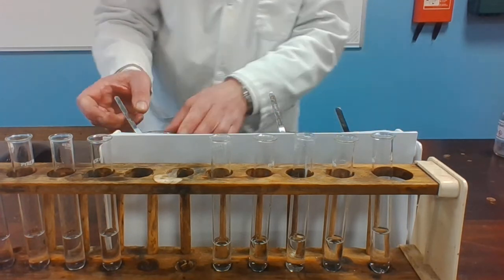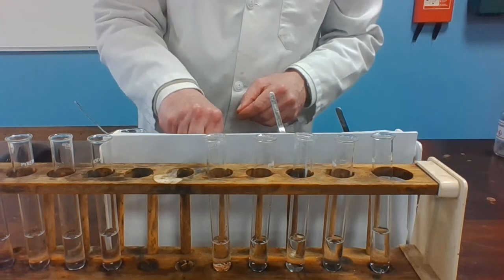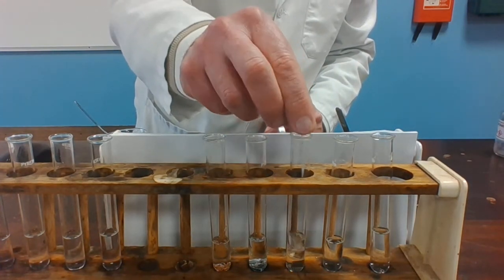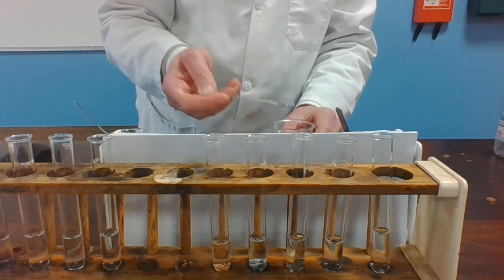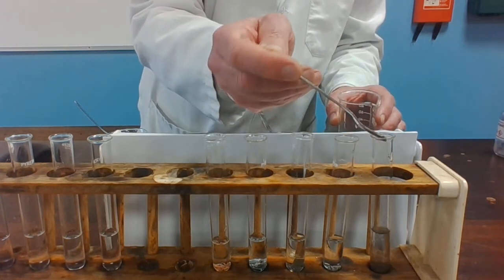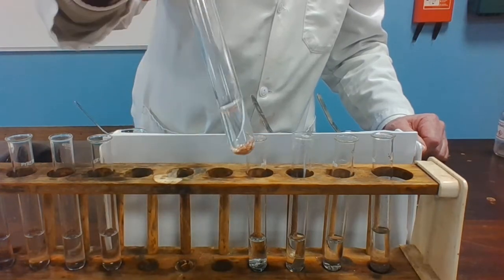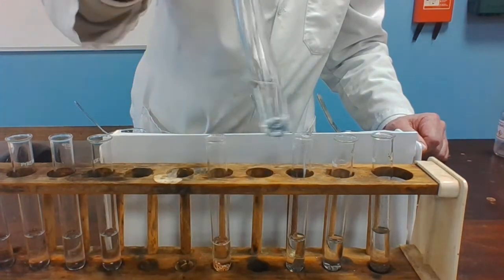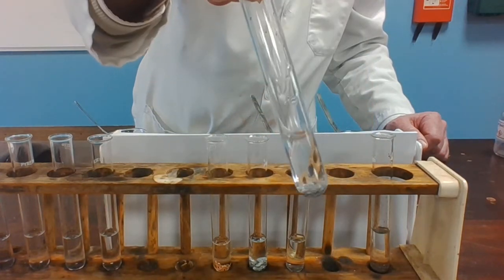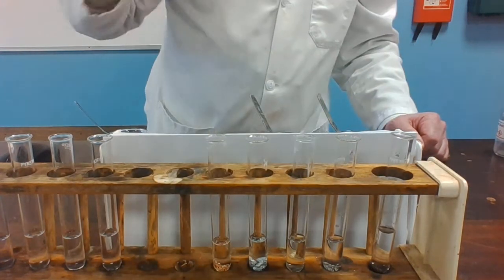So we'll start off with copper turnings in distilled water, zinc granules in distilled water, some lead foil in distilled water, magnesium turnings in distilled water, and finally iron filings in distilled water. We're looking to see if there's any evidence of a reaction. Copper, zinc, lead, magnesium, and iron — write any observations in the table on the sheet.